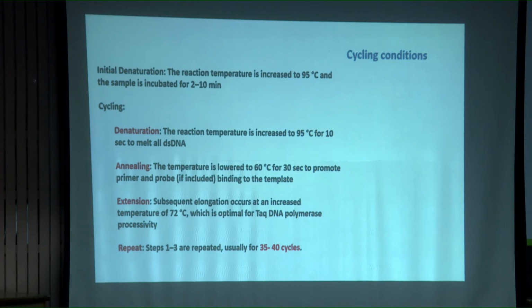Why is it not 10 or 15, and why is it not 100, by the way? You sit and calculate, you put the factor 2 power n. If it is 2 power 100, just see the quantum of DNA that is going to be accumulated. I think that should be equal to several planets' weight. It's not possible, right?